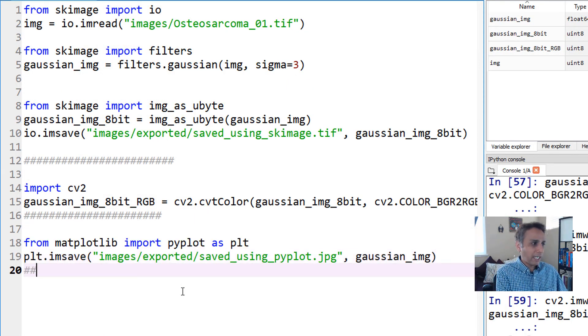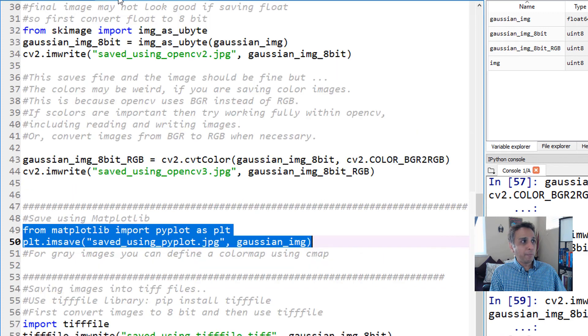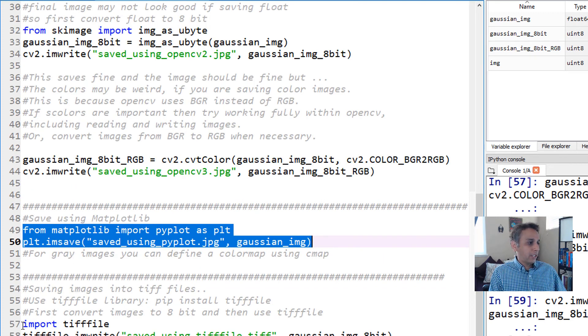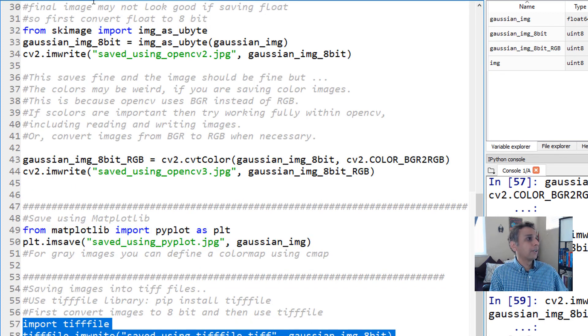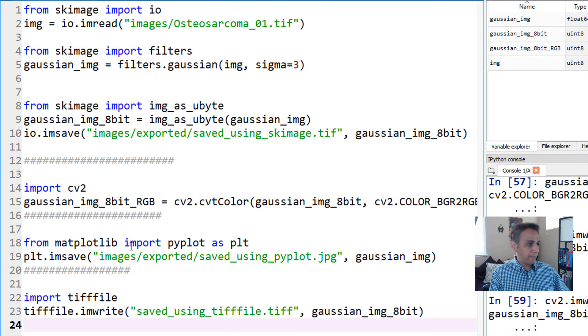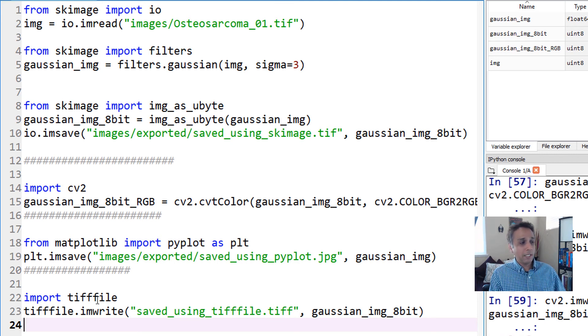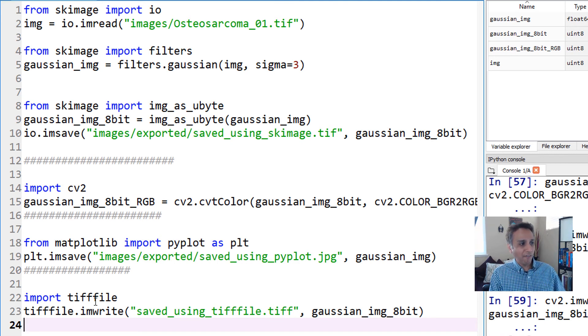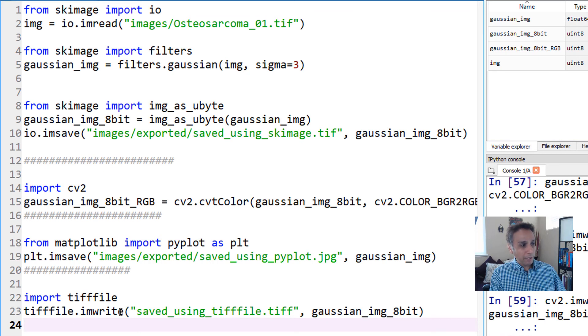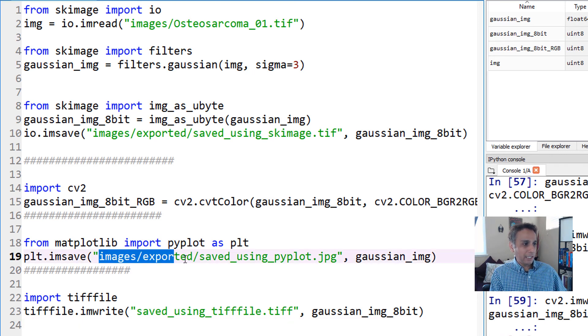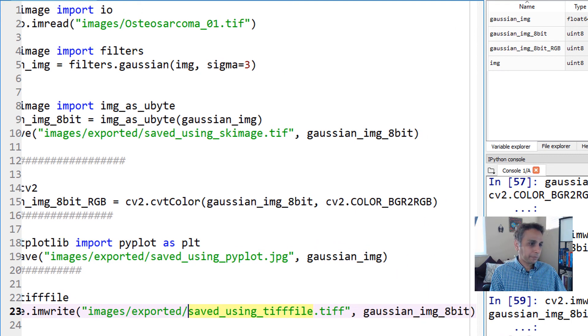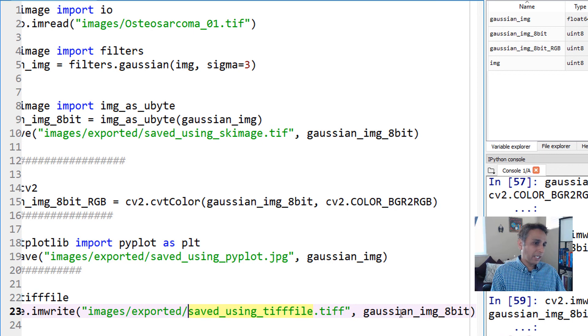Let's execute these lines. It's plt.imsave and we should have a pyplot image that looks very similar to other images. One other way is tifffile. We already used that functionality as part of scikit-image, but let's see it in its native form. In the previous tutorial we pip installed tifffile. If not, do pip install tifffile.